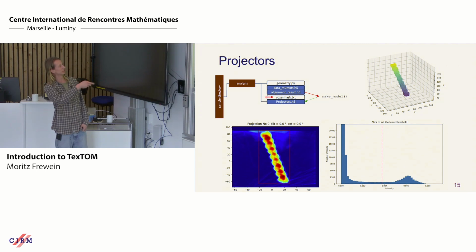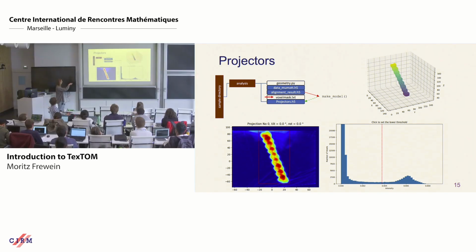Yeah, important to notice also, to do this we need a good alignment result already to calculate the proper projectors. So the user input will be like this. You draw a square around your sample, then it isolates this area. There will be another one for 90 degrees, so that we have a cube-like area, and then you can choose a lower threshold, and it will isolate your sample. You can look at it and confirm that you want to calculate the projectors in this way.